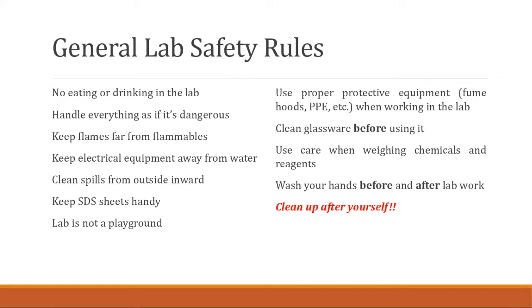So one of the key things I would like to get out of this, and I feel is important, is to handle everything as if it's dangerous. You don't know what you're handling, and if you take caution, even when handling ethanol, methanol, acetone, or nitric acid, if you handle it carefully, then you're already taking steps to being safe in the lab.